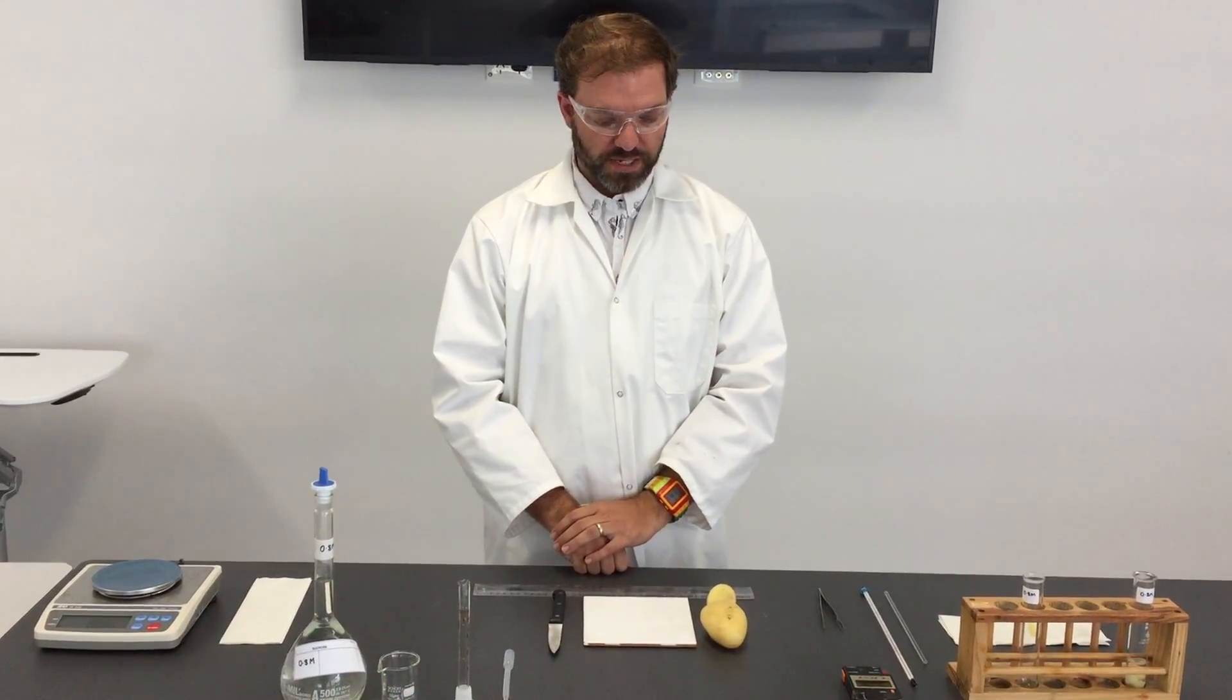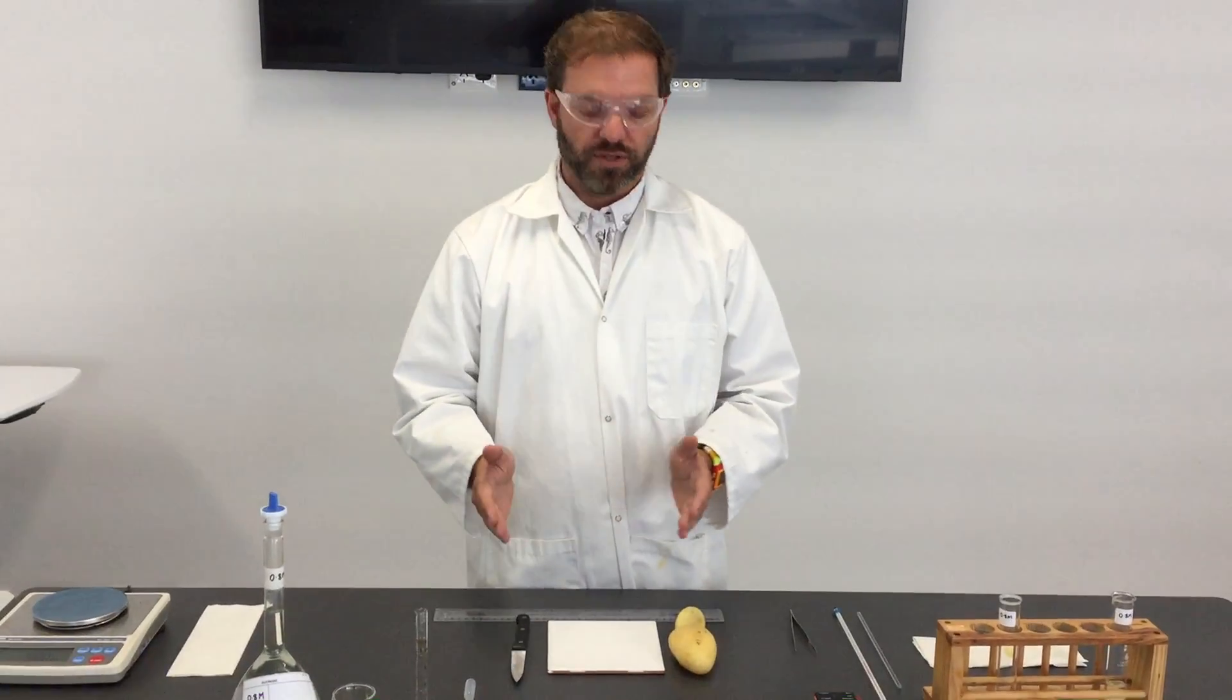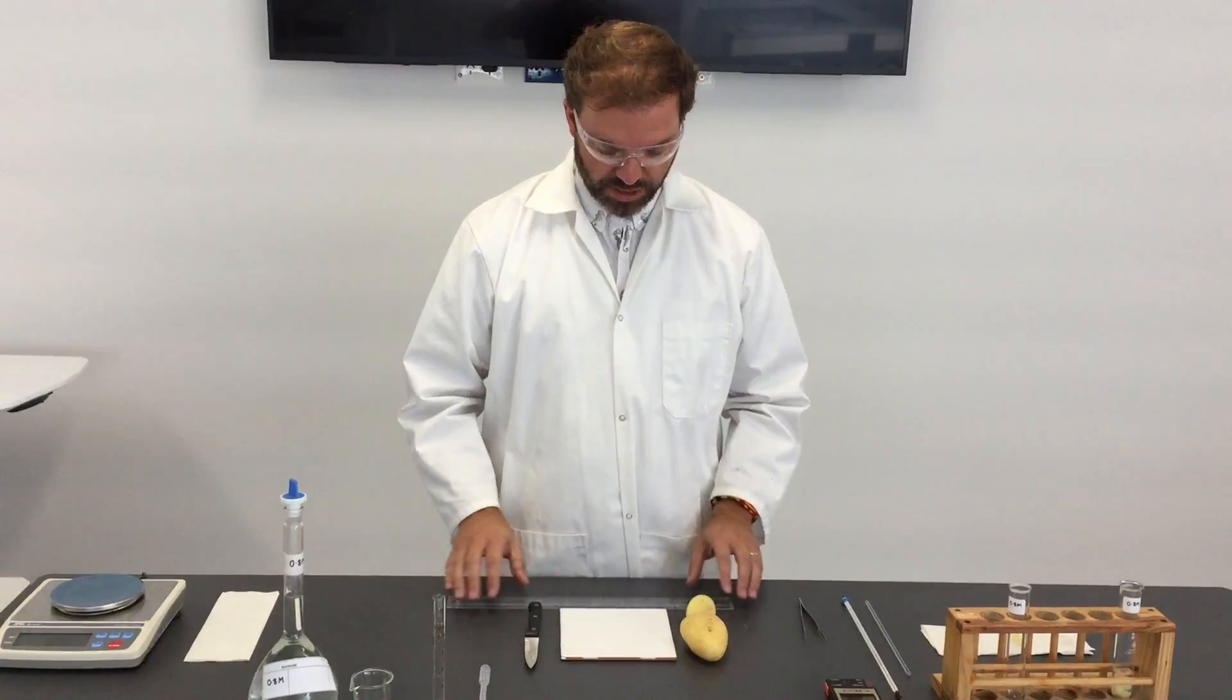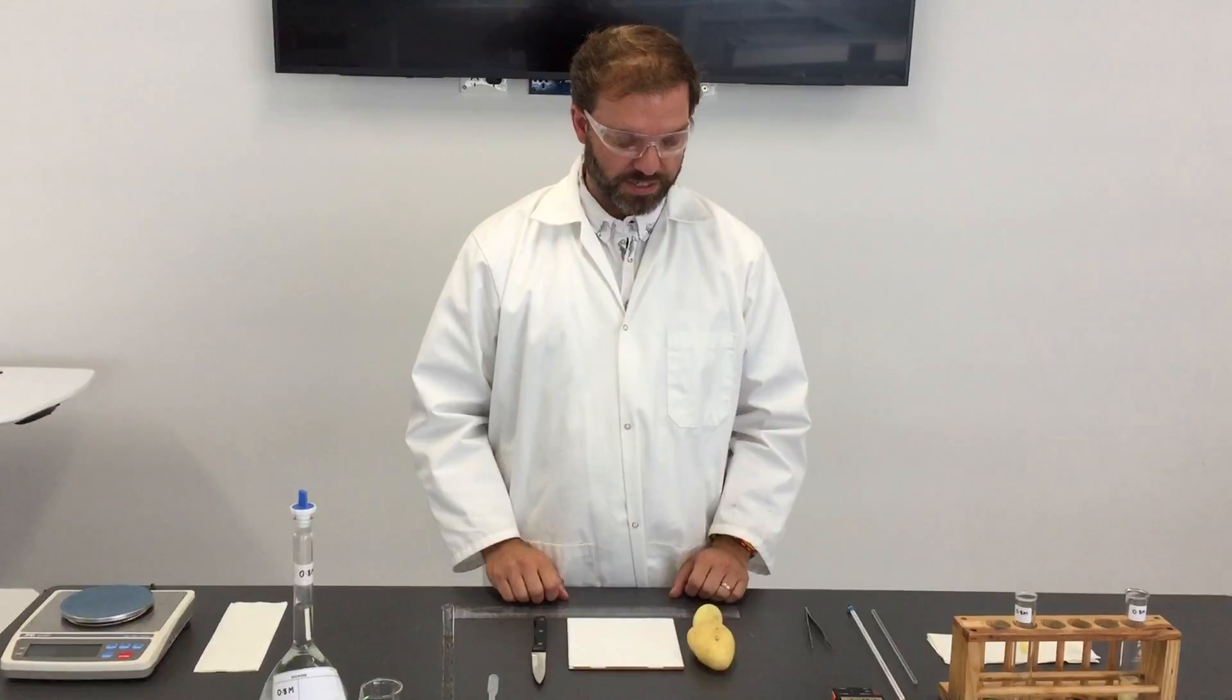So the first thing to do in terms of the practical is to produce even-sized pieces of potato. You can do that using a corer, or in this case I don't have the corer, so instead I'm just using a knife and ruler to measure out one centimeter squares.